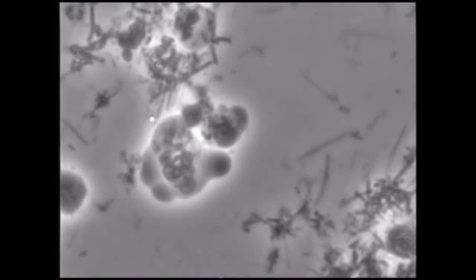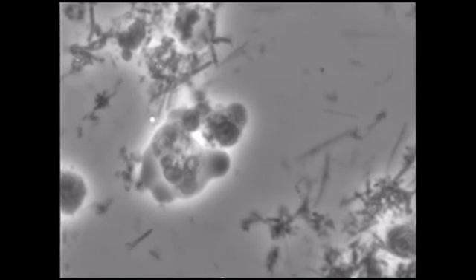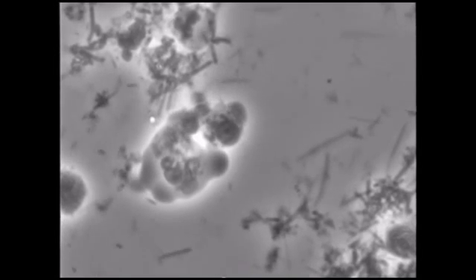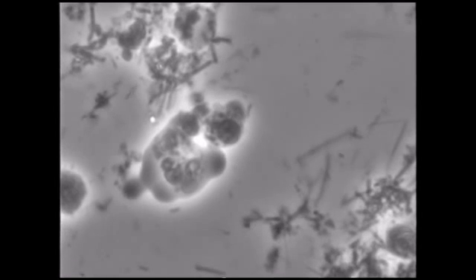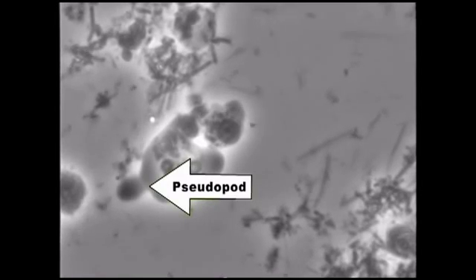The amoeba moved by putting out pseudopods or false foots, then flowing in the pseudopod motion. Somehow he's grabbed onto this white blood cell and is taking it with him, perhaps for a snack later.